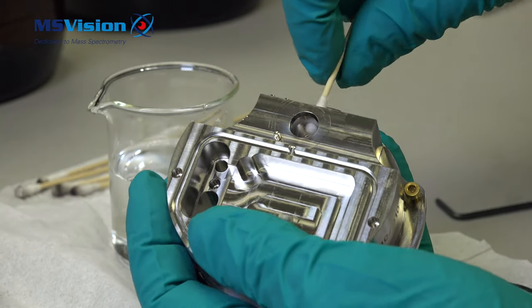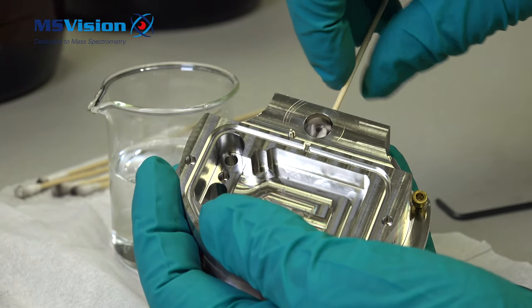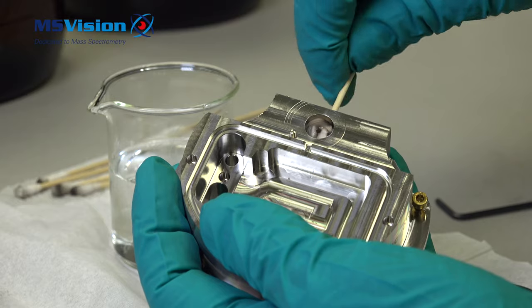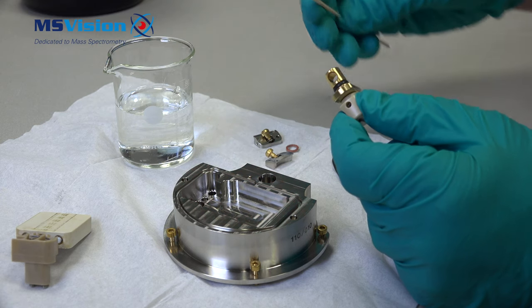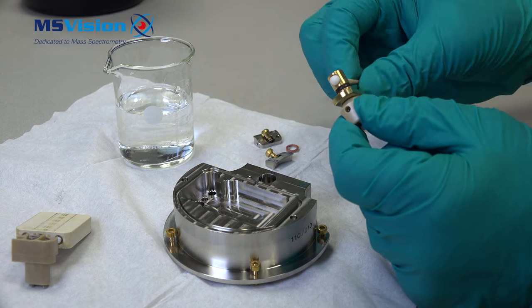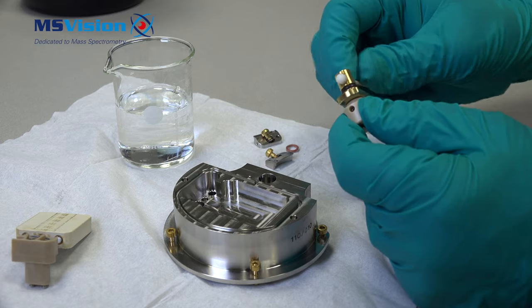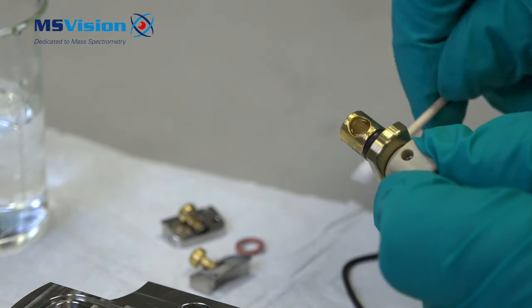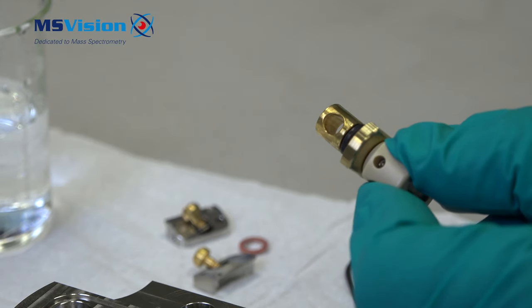Also clean the inside here behind where the cone fits. Now clean the isolation valve with the same water and acid solution. Use water to rinse off all the formic acid from all of the source components.